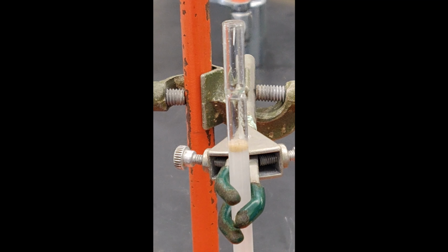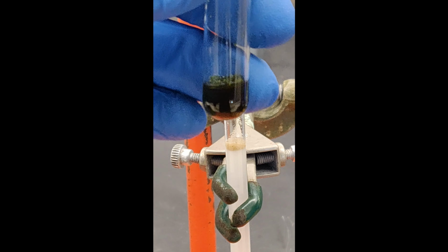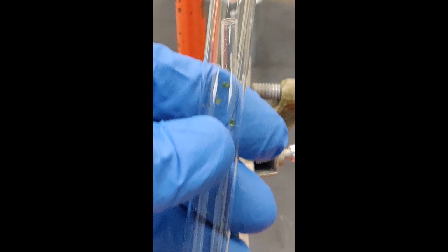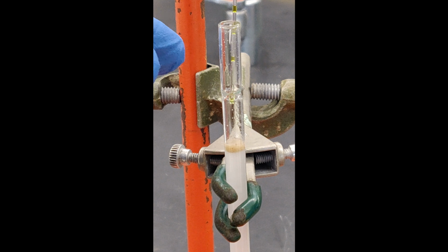Use a pipette and rubber bulb to transfer the green liquid from the test tube onto the column. Squeeze air from the bulb. Place the tip of the pipette flat against the inner bottom of the tube, then carefully draw up the liquid away from the undissolved plant material and add it to the top of the column.